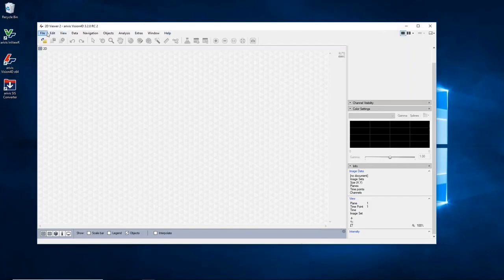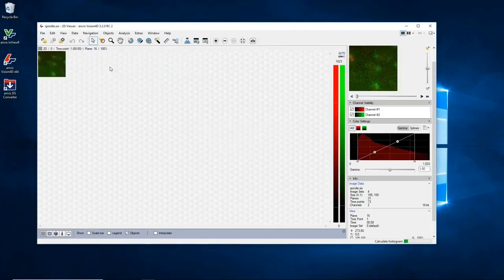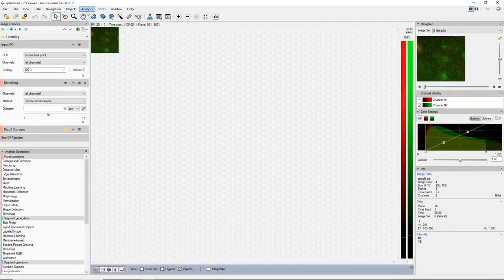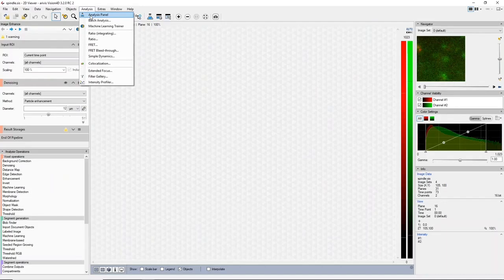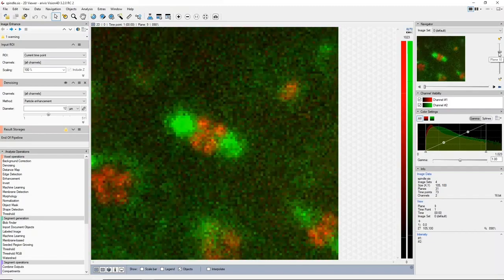Anyway, so let's get started with some of the new stuff we have in Vision 3.2 and specifically in the pipeline. So as always, you access the new pipelines analysis panel either through the conical flask icon up there or through the analysis menu, and you've got the analysis panel in there. So for all of you who are familiar with the software, who've been using it for a while to do things like image analysis, you will notice some things immediately. It looks just a little bit different.